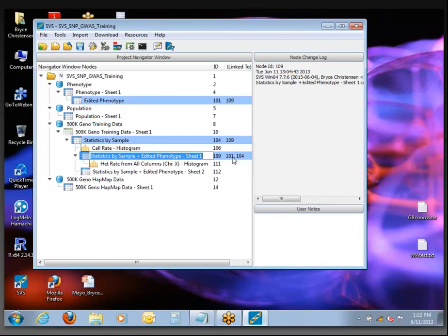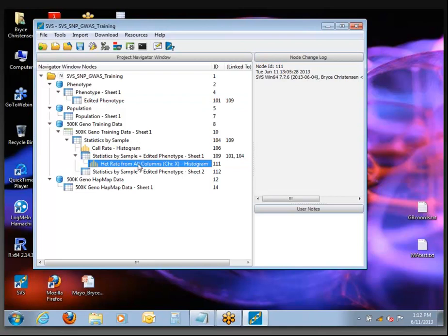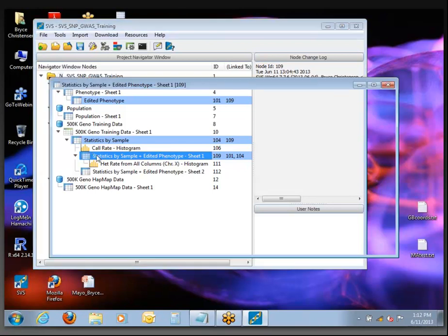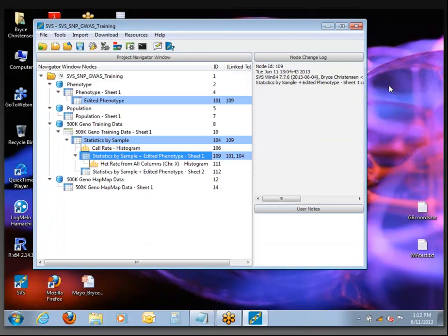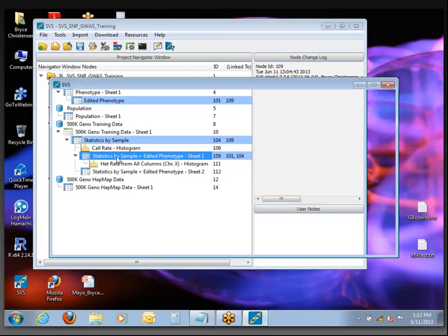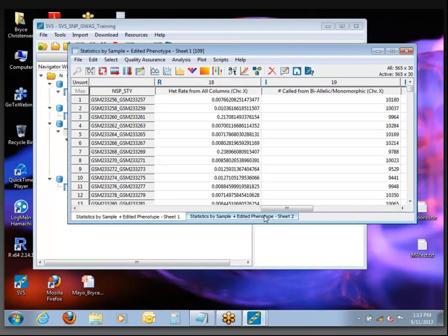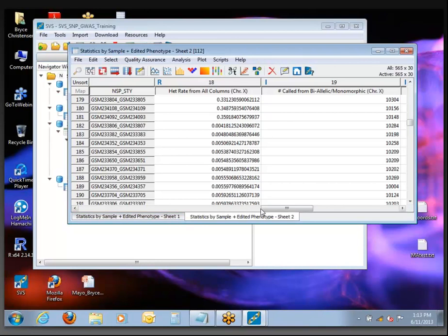We drew a histogram based on that spreadsheet, and once there was output associated with it, anything that changes the sort order or activation state of any columns will force the creation of a new one — because this one is frozen in time the moment we run any function on it. We want to be able to repeat workflows and not have anything changed. So when we sorted on heterozygosity rate after making the histogram, it created this second version — still the same data, but something about a column or row has been changed.